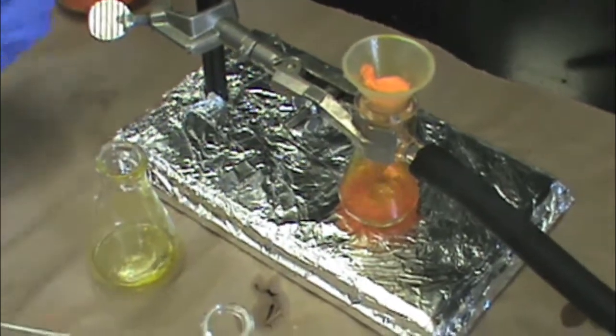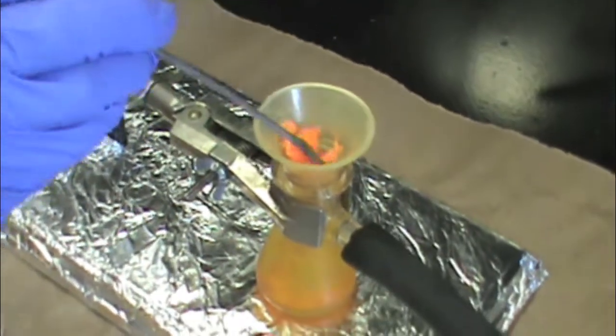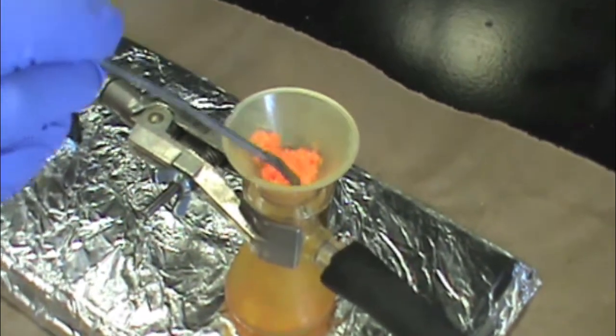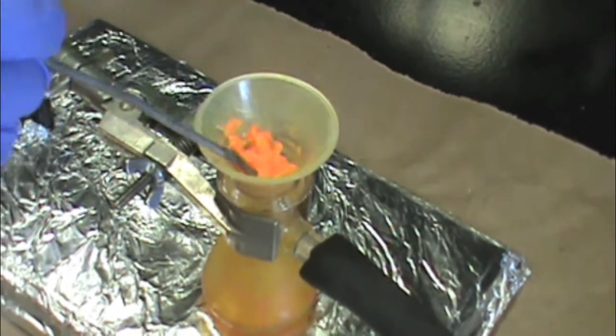Once you have transferred everything from your recrystallization, you can use a microspoon to move your crystals around in the Hirsch funnel and make sure that they dry well.